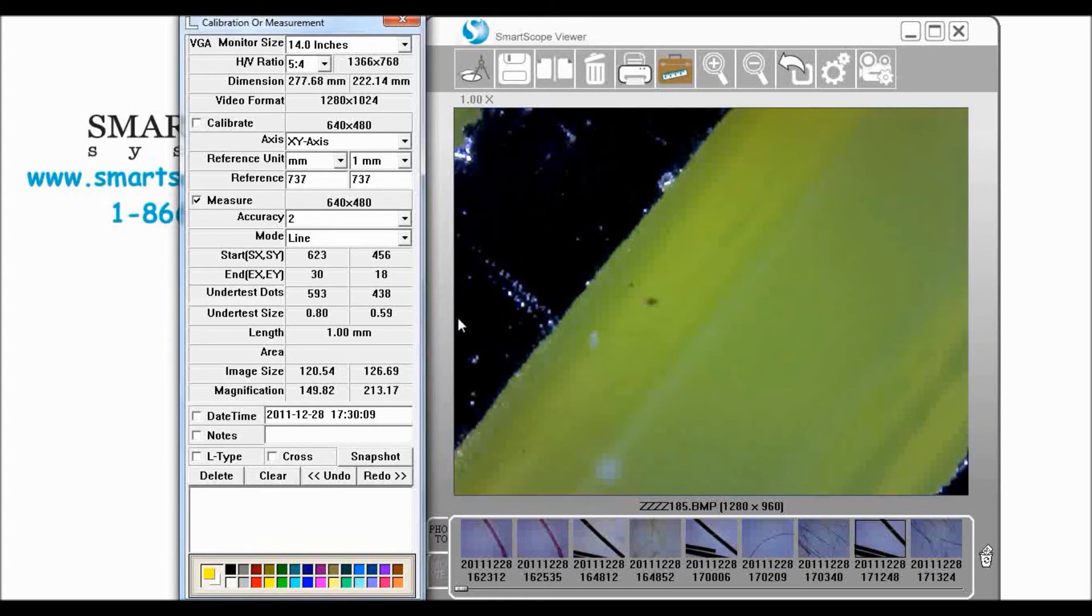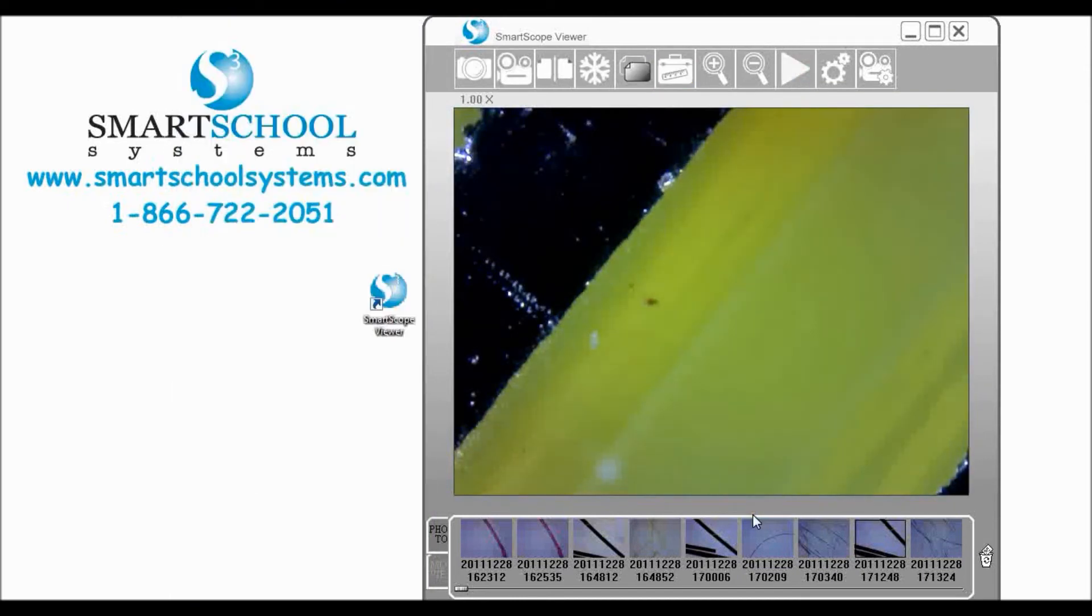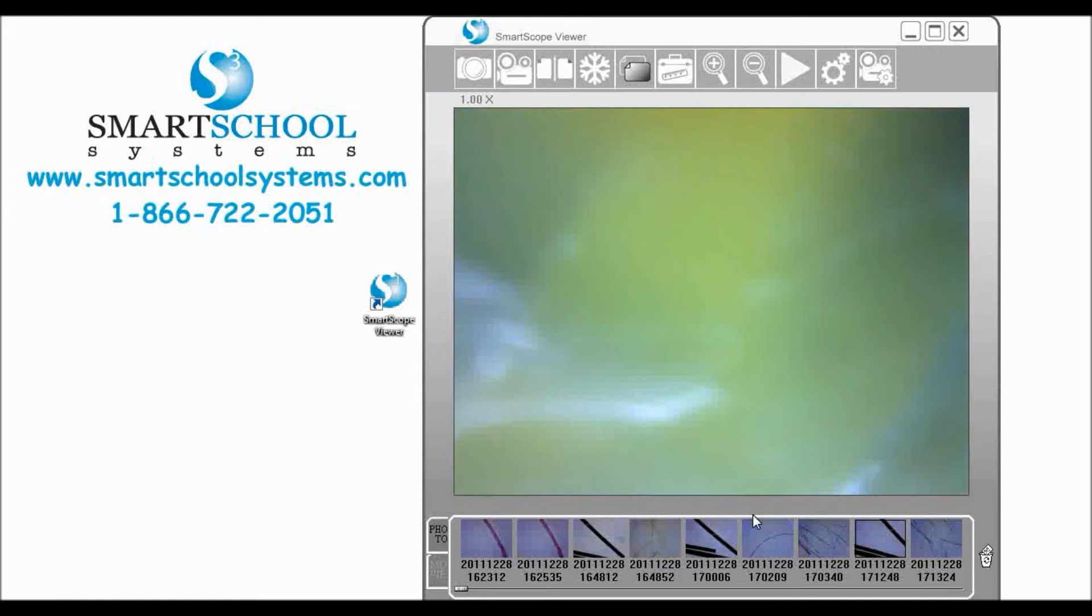So now that we've done that let's go ahead and go back out of this. We're going to move our ruler out of the way and we're going to put our sample there.